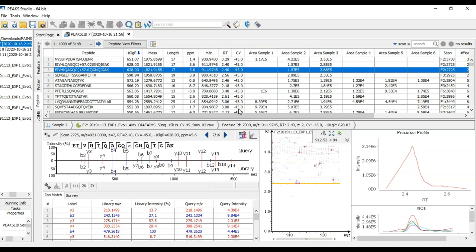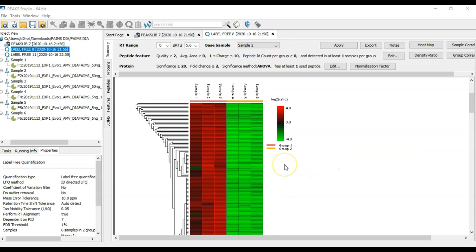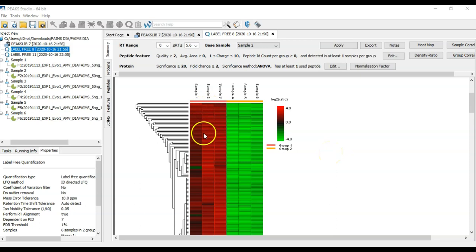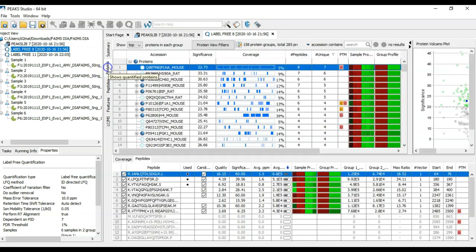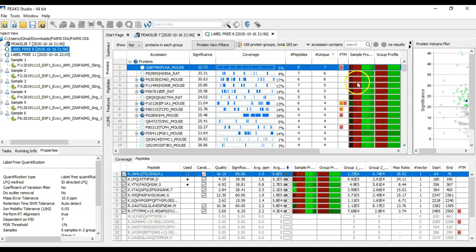Now let's take a look at the quantification result. Here in the quantification results, you can see that we have what we expect with this data, where the 50 nanogram data is highly upregulated against the 5 nanogram data. If you come here to the protein view, you'll see the broken down heat map that you would expect to see for our many peaks quantification result.